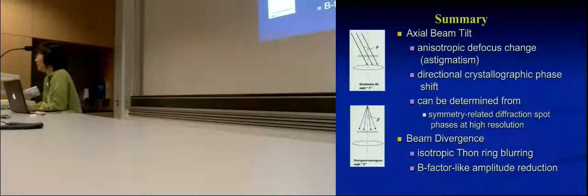So if you use a CS-corrected microscope that doesn't have a CS value, this should not be a problem. Right? Exactly. But there was this thing, if I'm not mistaken, that the CS correction works out to a certain radius in the objective lens diameter only, and from then on it's much worse than if you wouldn't touch that. Yeah, that I wouldn't know. No, so the CS correction completely fails if you go out of the center of the objective lens. Mm.